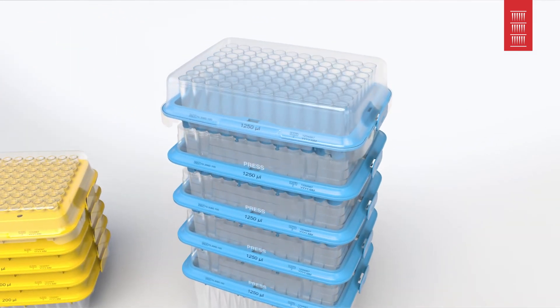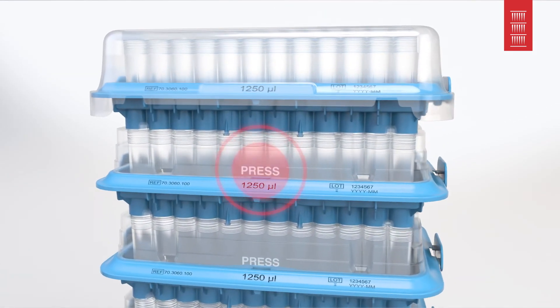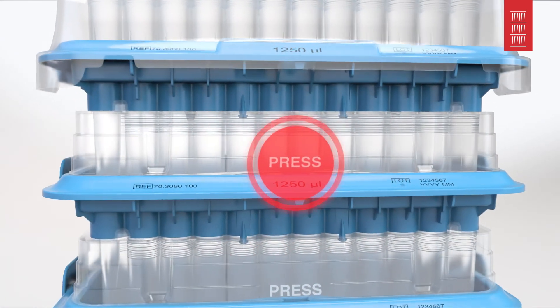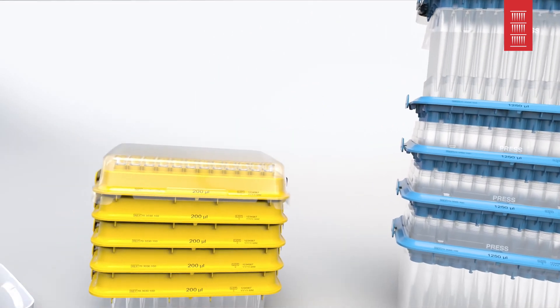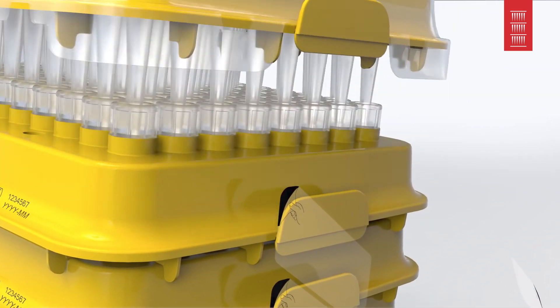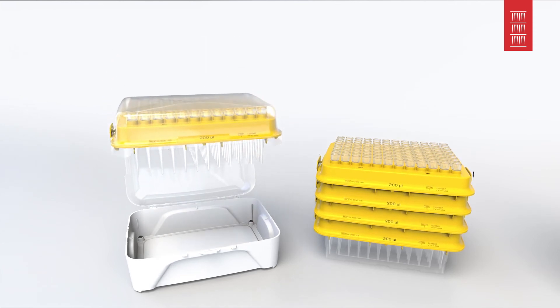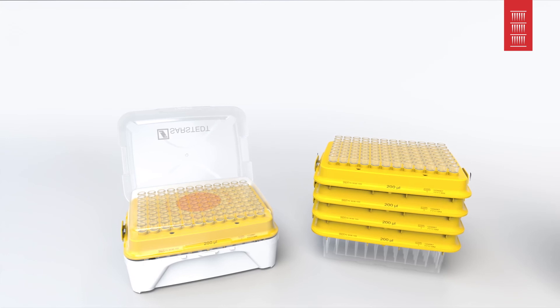To do this, simply push in the frame at the points marked Press at the front and the back. After two clear clicks, you can conveniently lift the tray up by the cover. For StackPaks without an intermediate frame, simply release the top tab on both sides. You can now lift the tray up with no problem and transfer it to the box. Gently press on the middle of the cover to securely engage the tray.